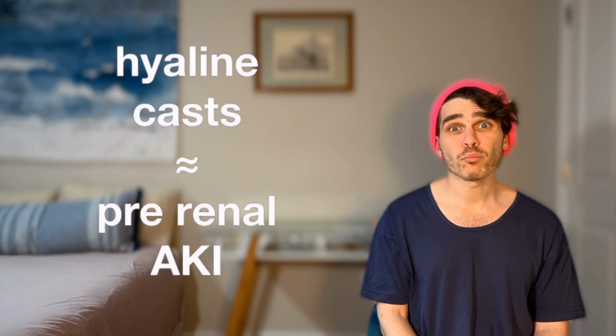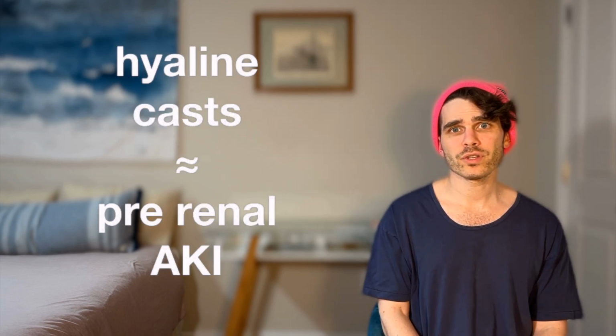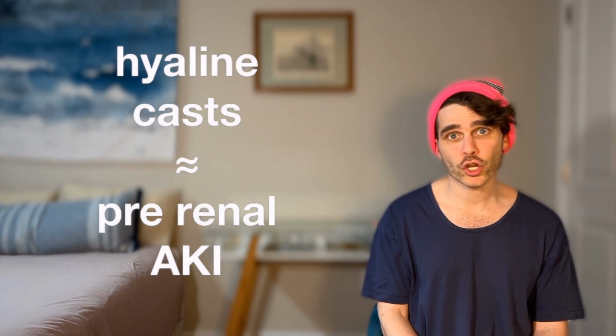The simplest of the casts is the hyaline cast, a cylindrical silhouette of sorts. It's basically a ghost cast that just has the outline of a cylinder and is essentially just the uromodulin. It can be suggestive of a pre-renal acute kidney injury that might correlate with sluggish urinary flow.